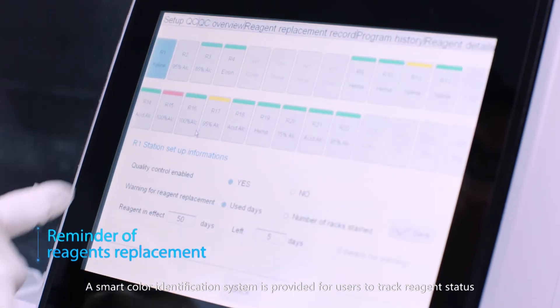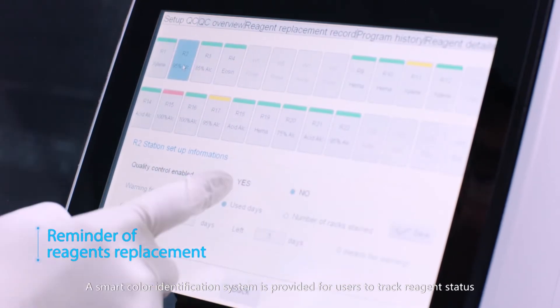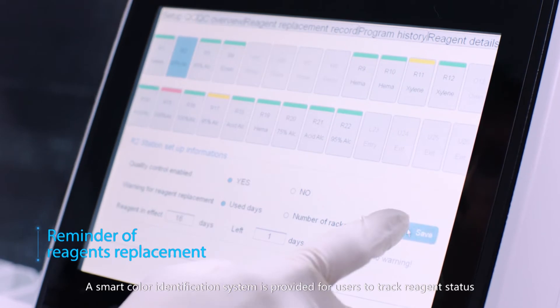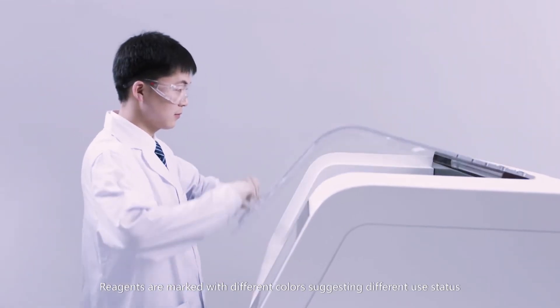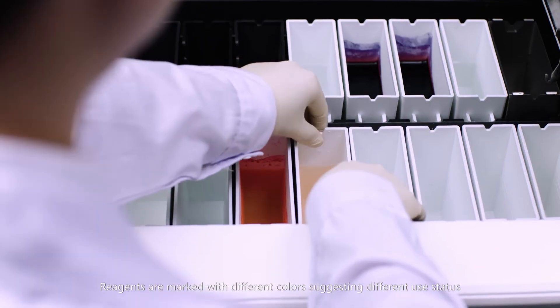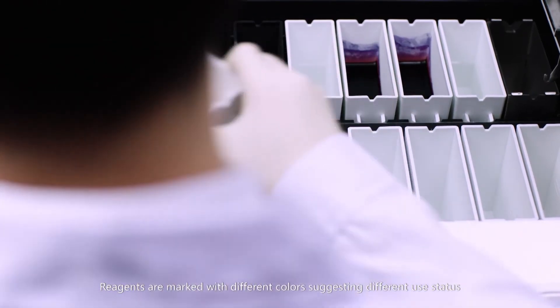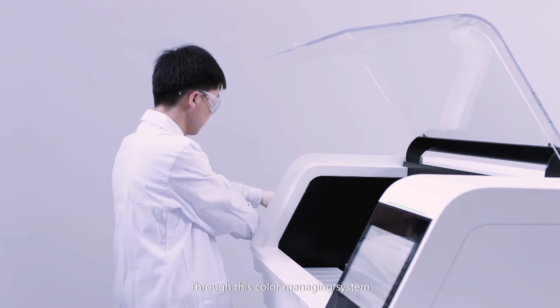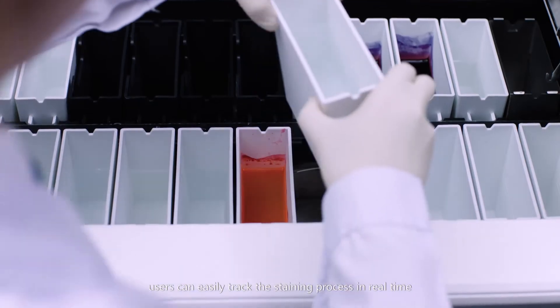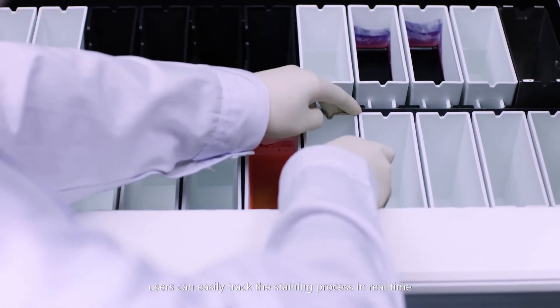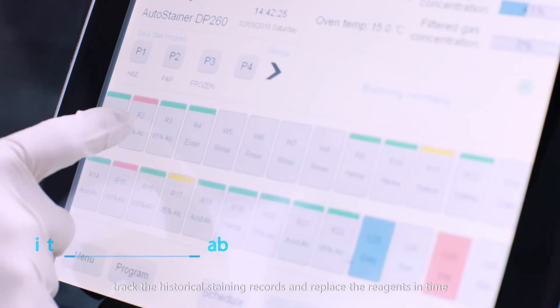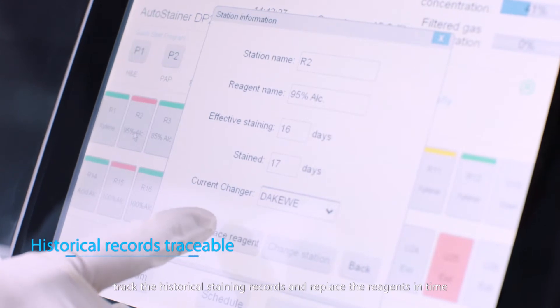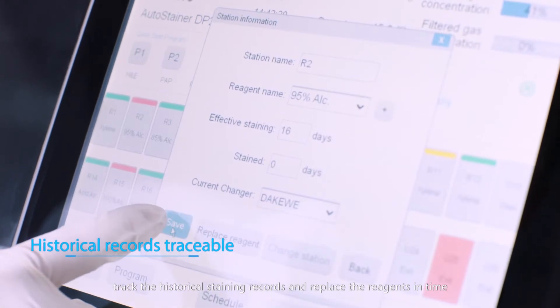A smart color identification system is provided for users to track reagent status. Reagents are marked with different colors suggesting different use status. Through this color managing system, users can easily track the staining process in real time and track the historical staining records and replace the reagents in time.